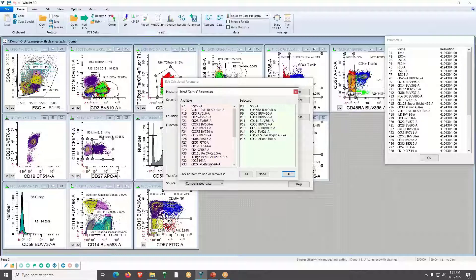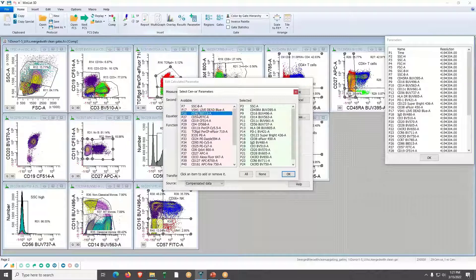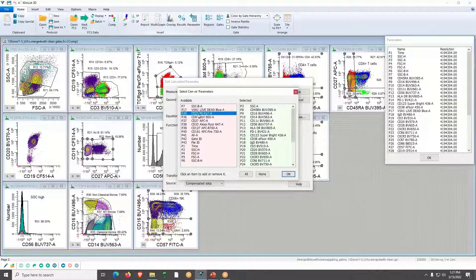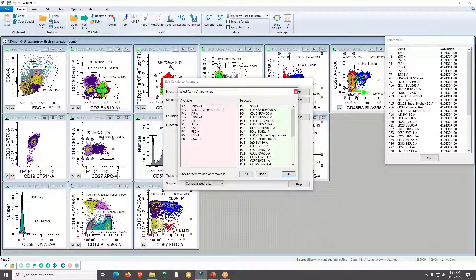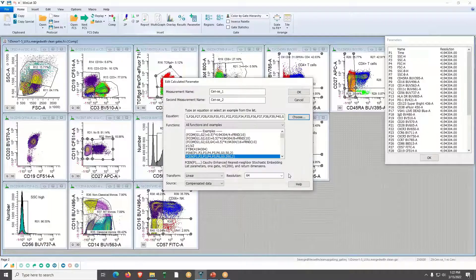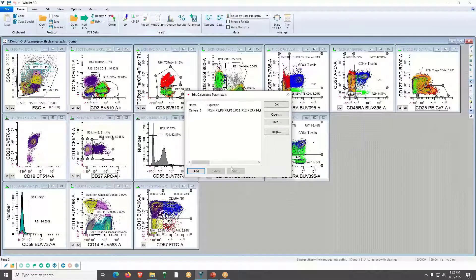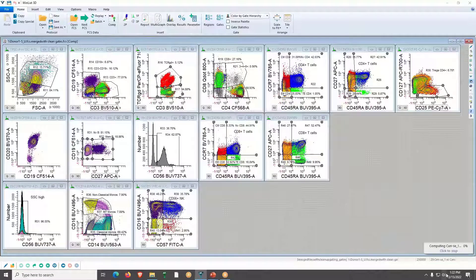I'll skip the live/dead parameter since I've already used that. I'll work through each measurement — skipping the ones I don't need — and click OK. I leave everything else as-is and click OK. Right away in the lower right you'll see WinList computing SENSEI and giving you a status report on how complete it is.